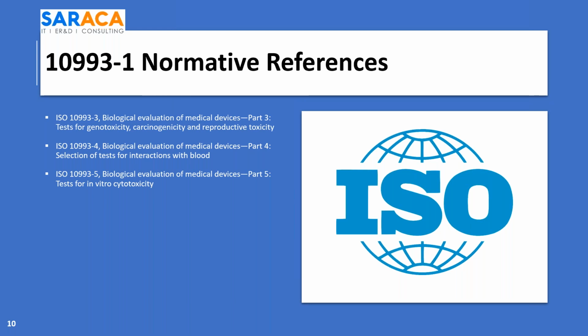I had a material once that I was evaluating. It was made with a red dye, and it killed everything. I didn't even get through the testing period. It just wiped everything out. So I never use red anymore in a device that comes in contact with tissue, because, at least in my experience, it's been toxic. I don't know if there are now reds out there that could do this, but that's just a little from my background. Part 6 is a test for local effects after implantation.